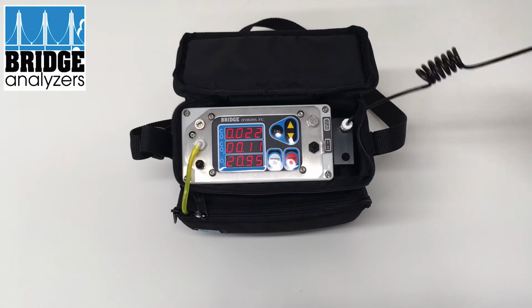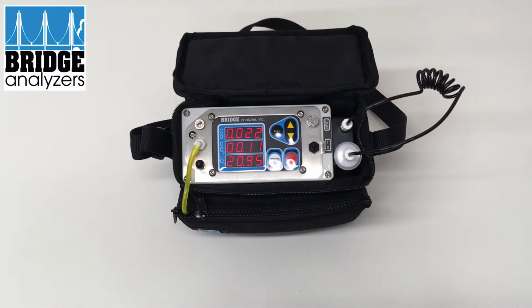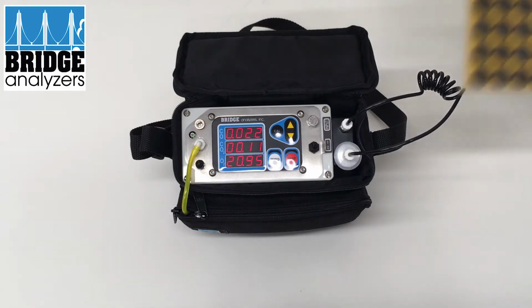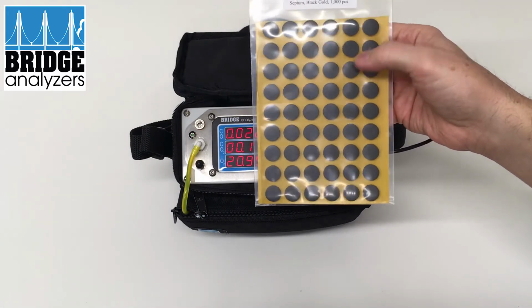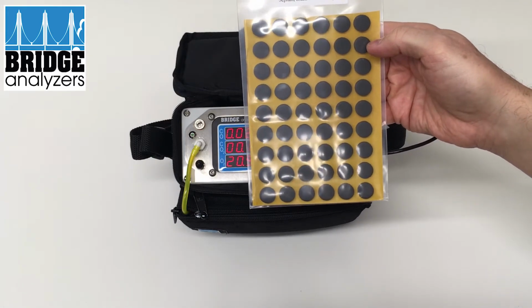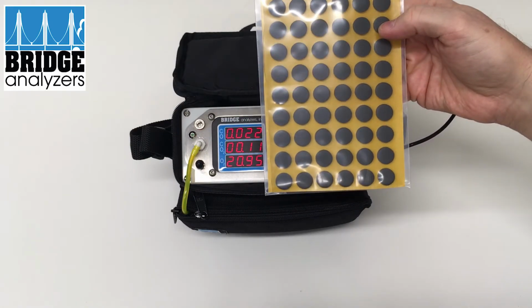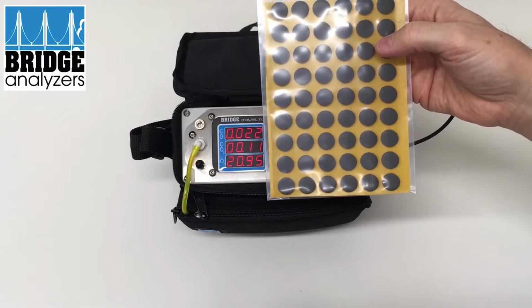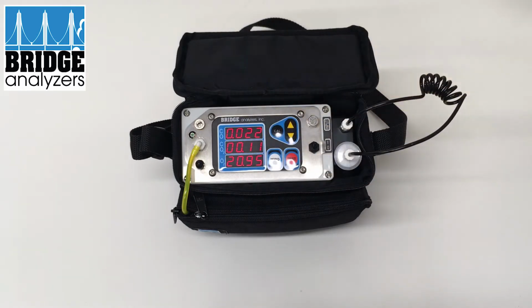We have some other videos that talk about best practices for testing a sample site. But there is a septum that people put on one of these black sticky nickels, or septum, onto the package, and then they poke the needle through there, and that helps to prevent ambient air from entering the package or package gas from escaping out of the package.